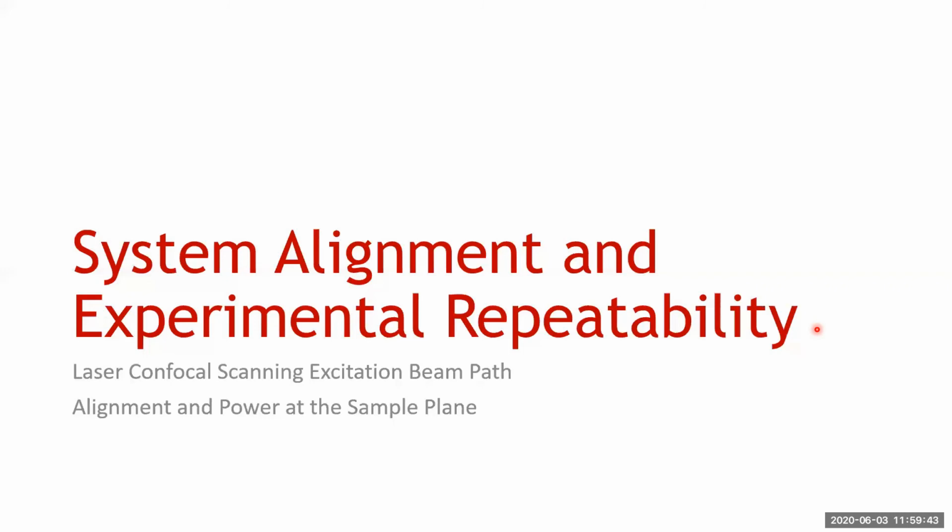As I mentioned, it really matters about your cover slips and your mounting media, because this can all mess things up. So you have to be consistent. On the microscope, especially the modern ones, you almost don't have to think about it, because you can save all your parameters, laser power, gain, filter set combinations, and you just bring them up.